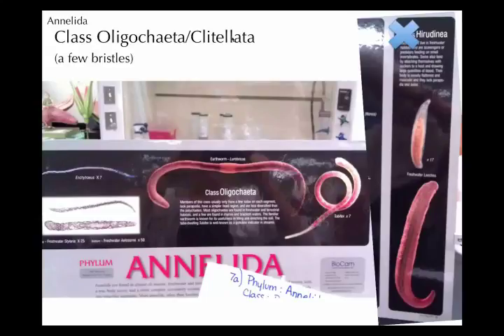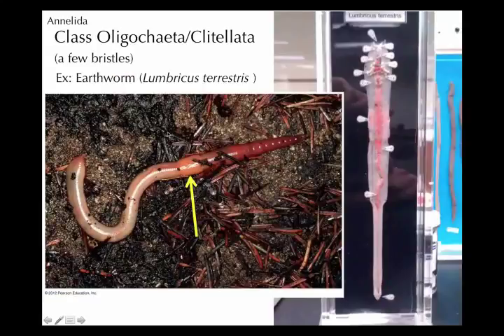Okay, so let's talk about the earthworm group first. So the earthworm group, oligochaete means few bristles, chaetes again, oligo like oligarchy, few rulers. So these guys have a few bristles. We felt on the bottom of the earthworm, the preserved ones, we could actually feel little projections. Those are the setae, which are the bristles.